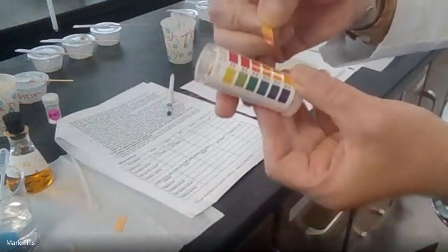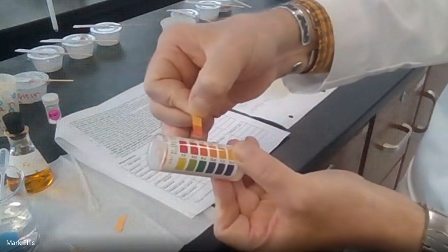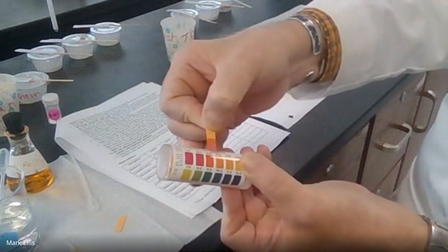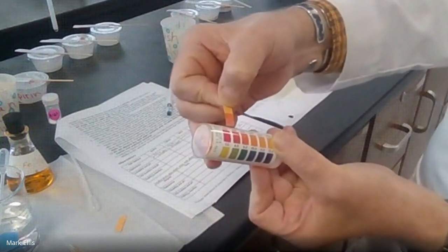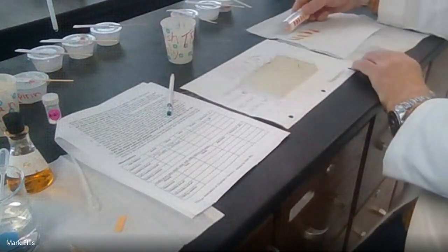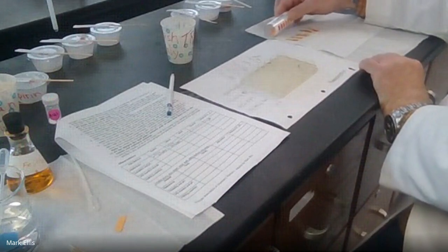Now on the pH paper guide, you can see it's somewhere between 1 and 3. You don't have to get the exact thing, but it will dilute as it spreads up. So that was about a 1 or a 2. The Excedrin was about a 2, and the first one was about a 1 or a 2.